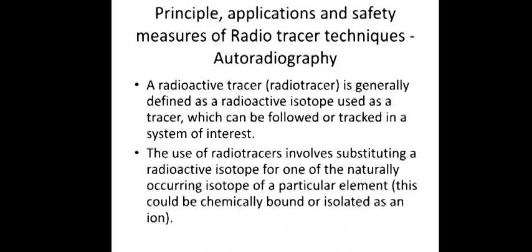And depending upon the number of radioisotopes present in a given sample, the concentration or the intensity of the particle that is emitted will vary. So if you could incorporate a radioactive element in a system of your interest, you can identify the position of the molecule or chemical component of your interest in a given sample.